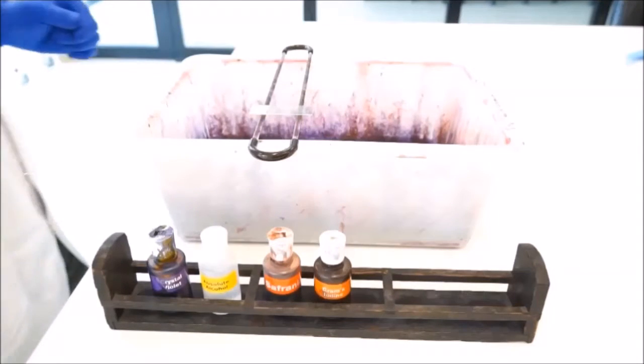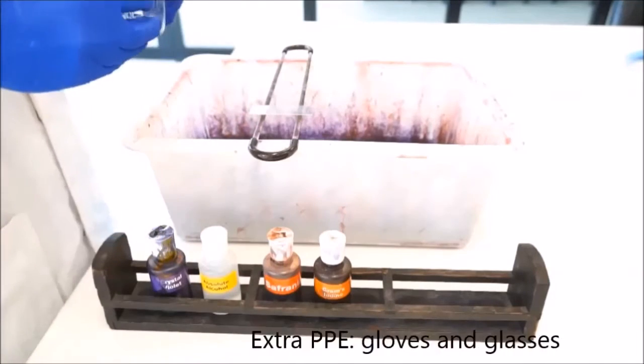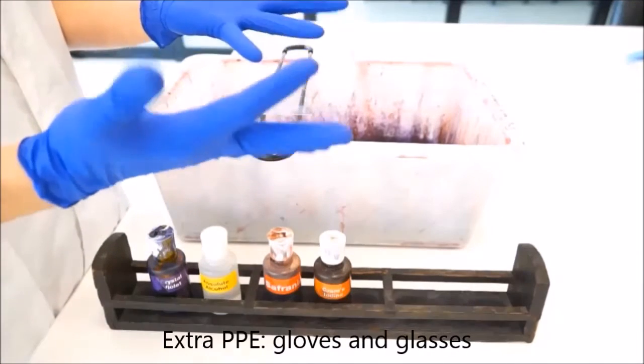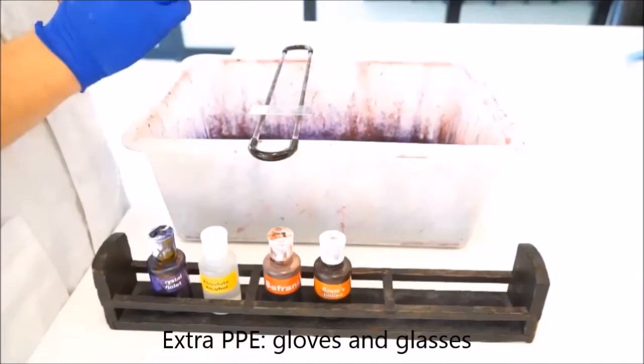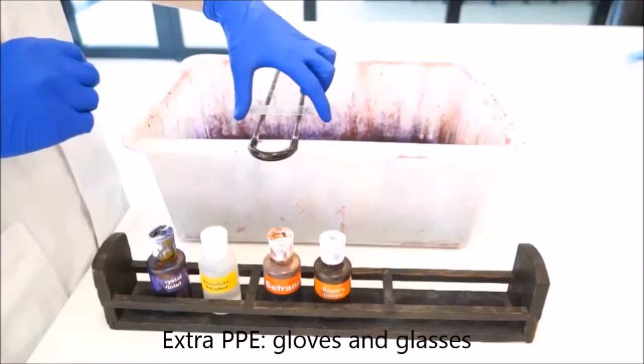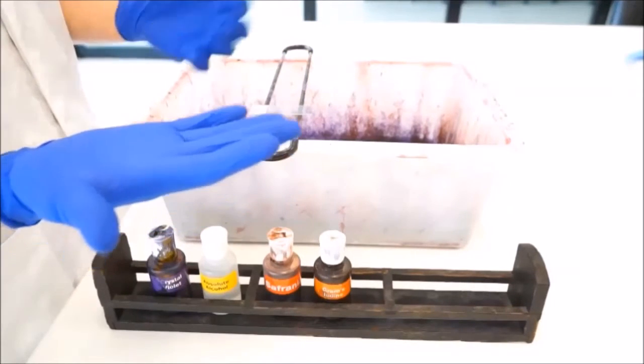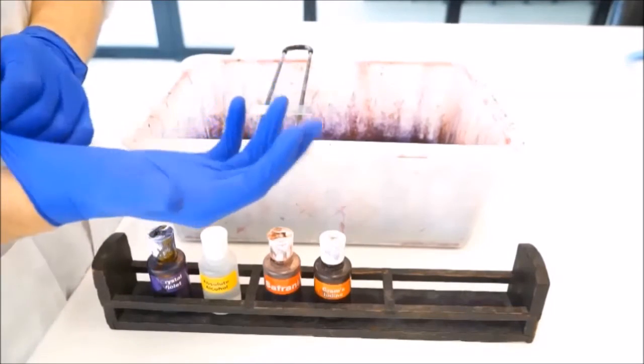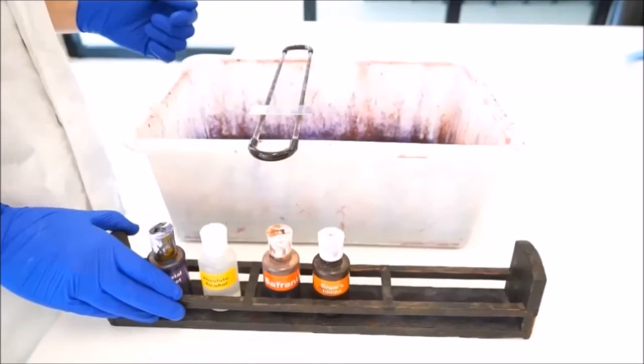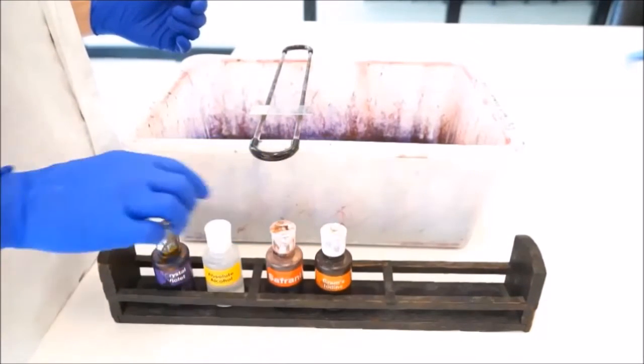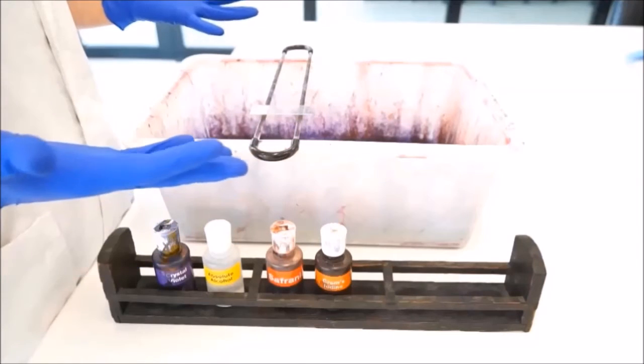At this point you want to be putting on safety glasses - you don't want these stains in your eyes - and also gloves. Previously when making the heat-fixed slide you wouldn't want gloves because gloves and Bunsen burners don't mix, but right now some of these stains are a little bit toxic so I'd be wearing gloves.